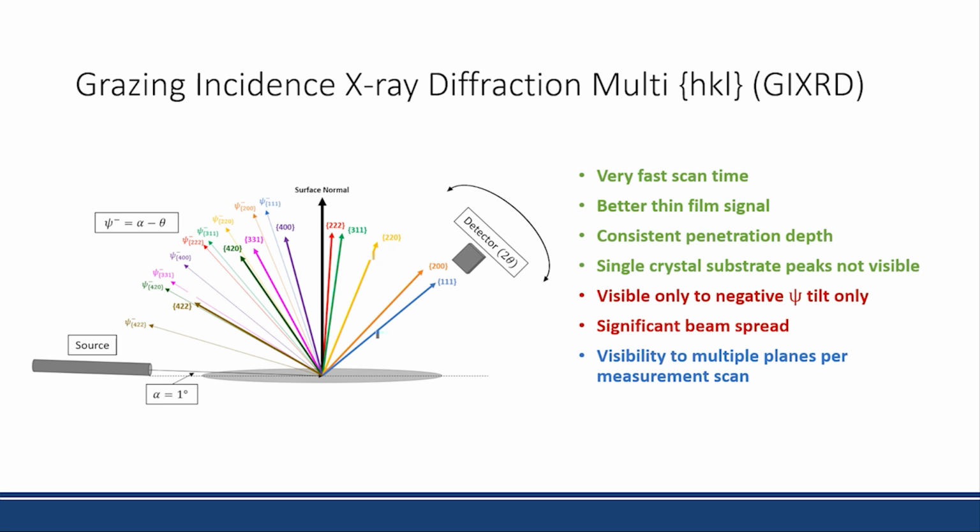And I put this in blue because this is not necessarily an advantage or disadvantage, but something that you should be aware of. So all of these techniques that I've described so far are available and are very robust in the MCL downstairs. And Nicole and Anthony can train you how to do those. And it's worth looking into for sure if you're interested in looking at residual stresses.